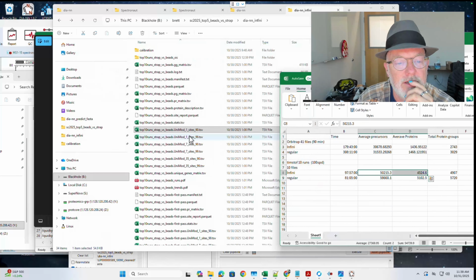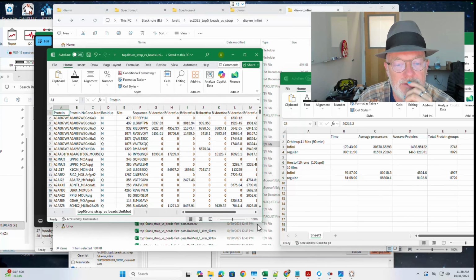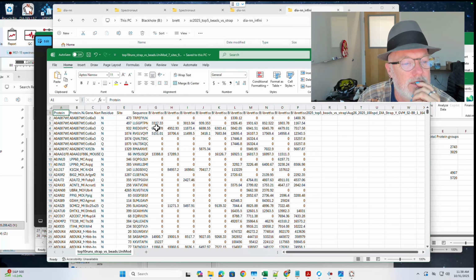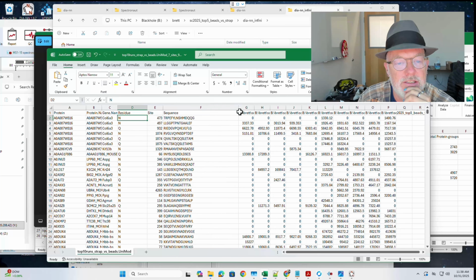Don't save. And then this is 7. And that's deamidation, right? Okay, so that makes more sense. And in Q. Okay, so there's all... Oh, and this is the site on the protein, I would guess, not on the peptide. So that would be 473. Let's see, that's interesting. I wonder why they do it that way. There must be a reason.